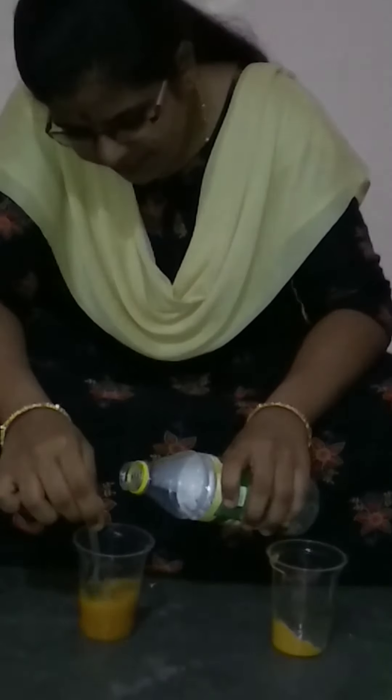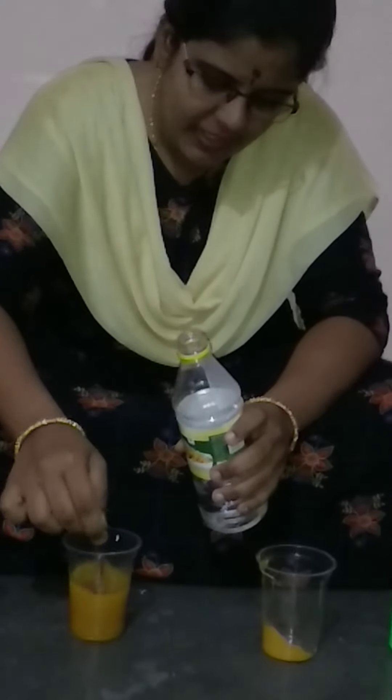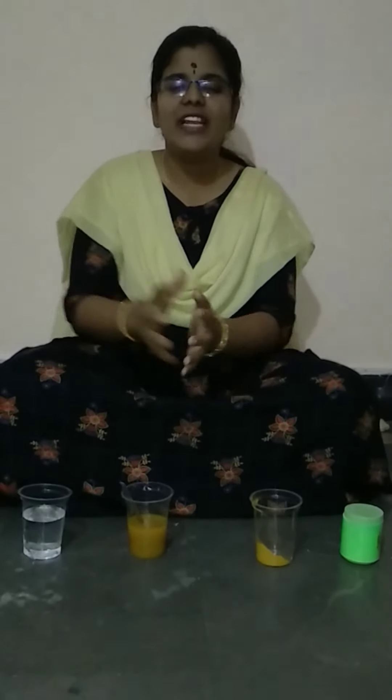Can you observe it, children? Isn't it very interesting? Let me add some more ml. This is what the titration reaction or neutralization reaction is. So what happened?